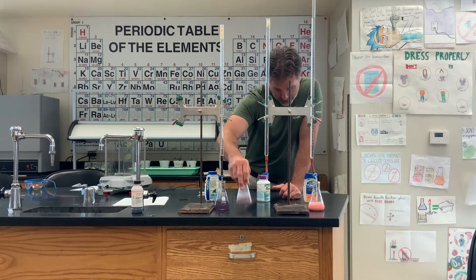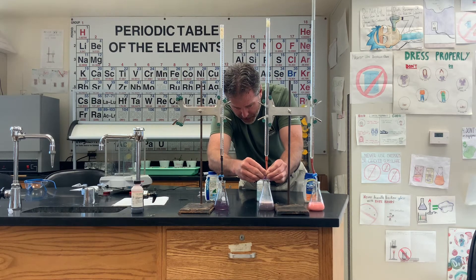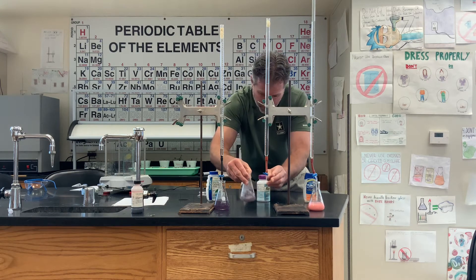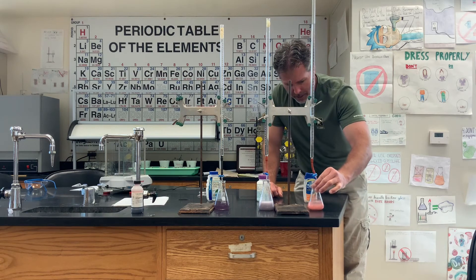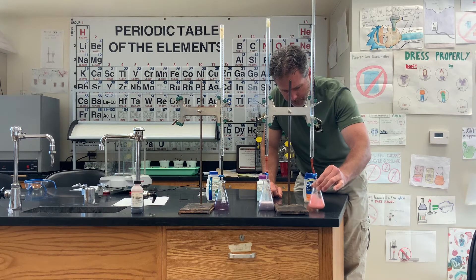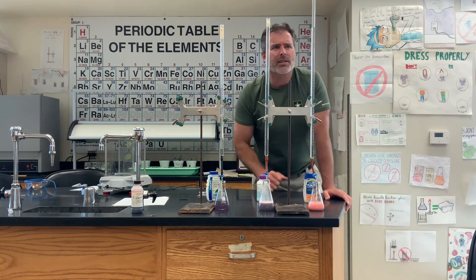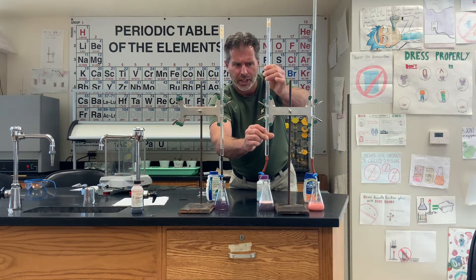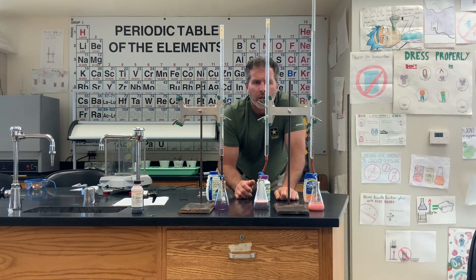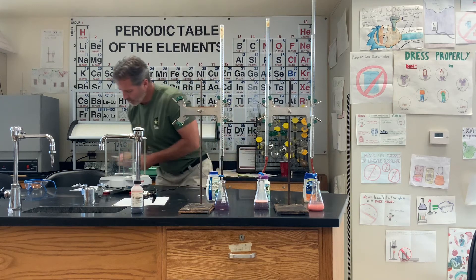I'm going to add another drop or two to the Rolaids to see what happens — very bright blue there. Getting back to the Tums, it's starting to turn a little bit. I'm just past 12 milliliters on the Tums. On the Rolaids, we're going to go ahead and call that good — that's 23.05 milliliters.